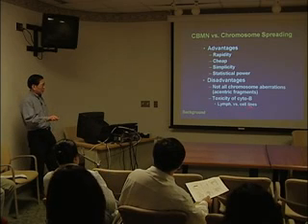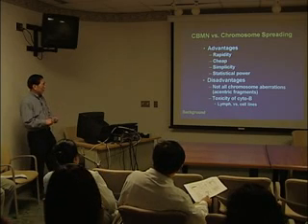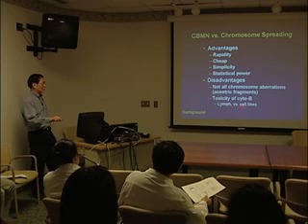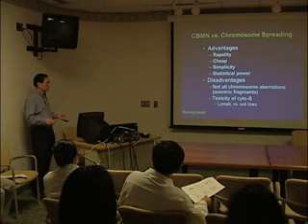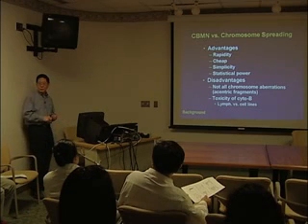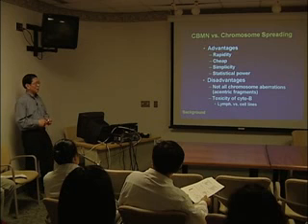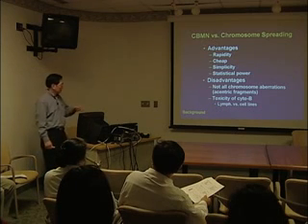For example, when you go to the lab, you find out that you have to use different amounts of cytochalasin B to get the micronuclei. Lymphocytes usually are more resistant to cytochalasin B than some of the tumor cell lines, so you really don't have a uniform method you can apply to, say, minimize the toxicity from cytochalasin B.